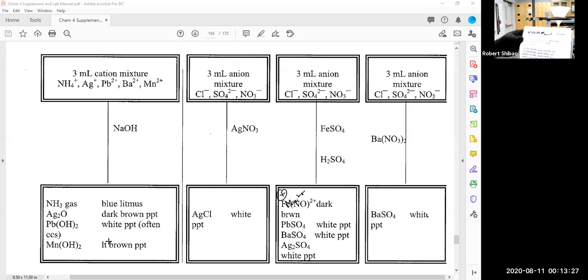So I have filter paper, they have different types of filter paper. This is number 413, qualitative. And it depends on what pore size you want in the filter paper. It depends on how much you want to catch. Now the filter paper is a round circle like this. And we got a conical cone-shaped funnel. So we have to fold the filter paper.